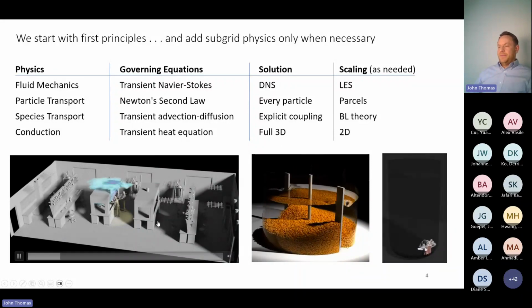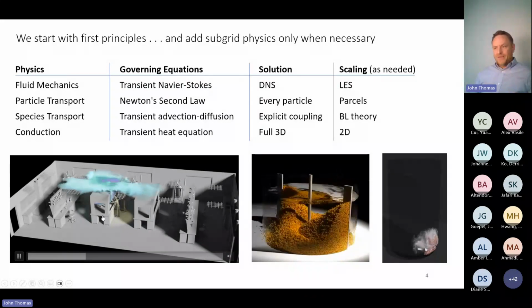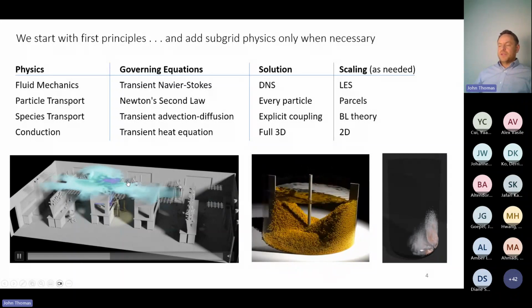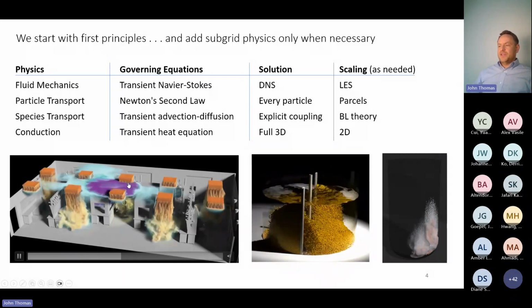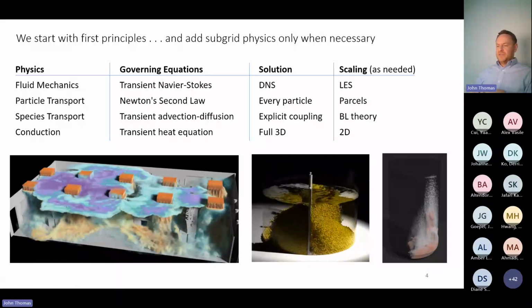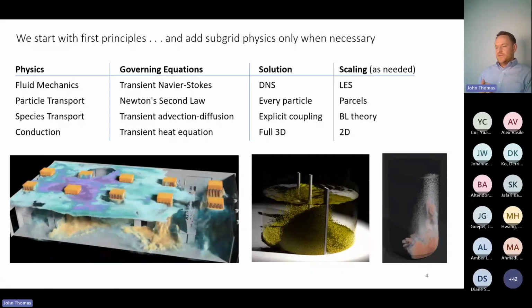And here are a couple examples. This is just looking at a clean room where, again, this is more PID stuff, where I've got some sort of PID sensor that's measuring the DO concentration. I'm sorry, the gas concentration. And when it gets above a certain value, this purge system, this vent system comes on, trying to remove these excess gases from the room that escaped under the hood.